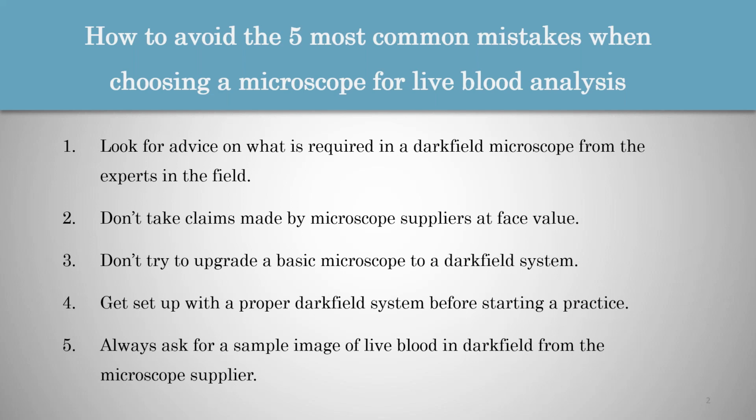Unfortunately, this doesn't really work, because if your microscope isn't really suitable for darkfield microscopy, then you won't really be able to build up a live blood analysis practice, because technically you wouldn't really be doing live blood analysis properly. And we do see that in practice as well. People really struggle to get the results that you should be getting from live blood analysis if you don't have the right type of microscope from the start.